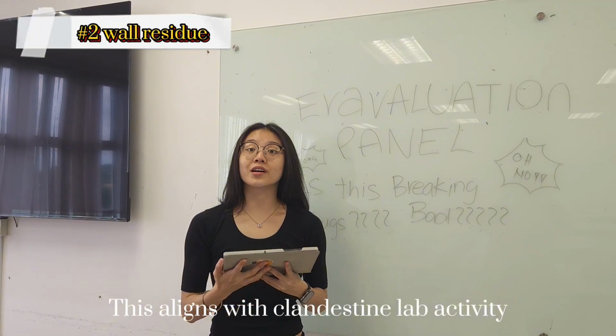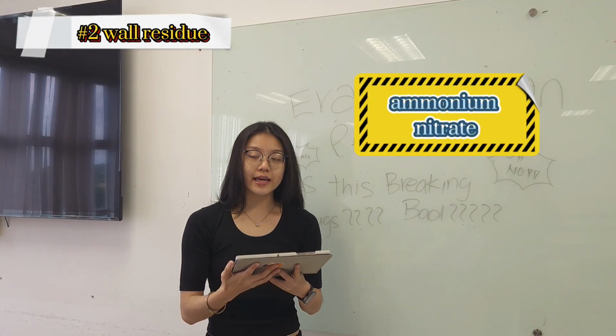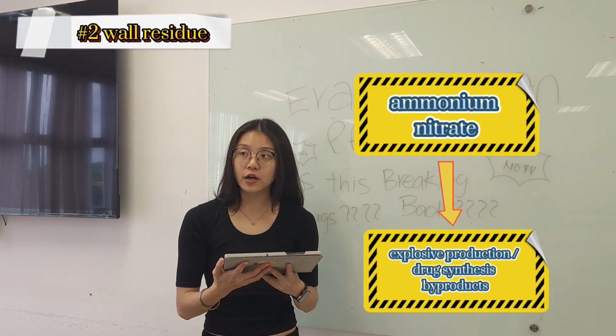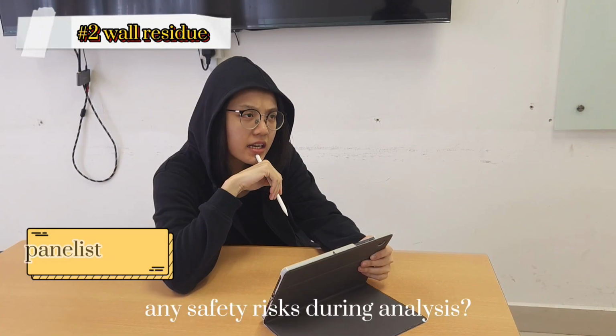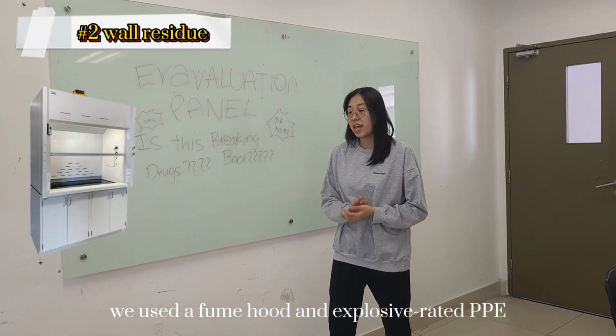This aligns with clandestine lab activity. The ammonium nitrate could indicate explosive production or drug synthesis byproducts. Any safety risk during analysis? So we use a fume hood and explosive PPE.